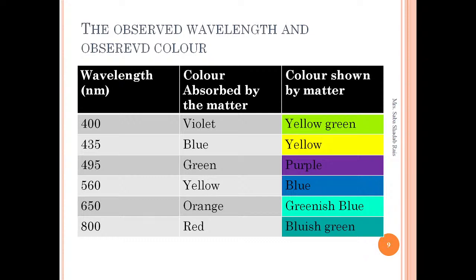बच्चों, ऐसे जब visible light आती है तो visible light is not like कि वो सिर्फ 400 नैनोमीटर की आएगी, 435. It is not definitely going to come at that particular wavelength. What we need to do is place a filter, which I'm going to explain in the next slide. This filter is going to choose only the 400 nanometer light, the violet light of the visible spectrum.